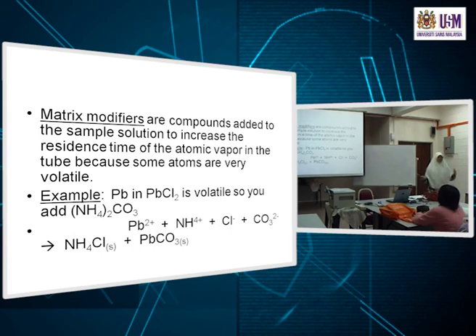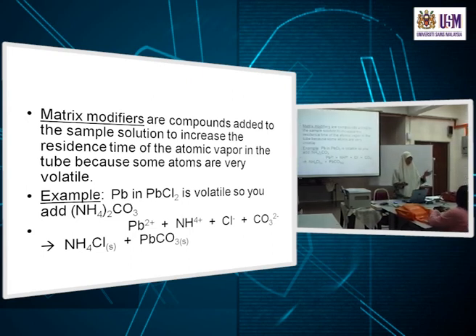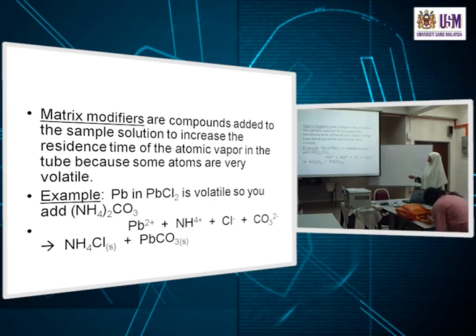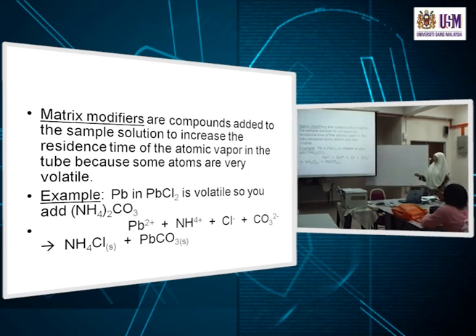There are several others, so it depends on which element, what matrix modifier would be necessary. Remember, you would not only add it to your sample, you may also add it to your standard solutions. And because you are adding some external reagent to your sample, you must make sure, of course, that the matrix modifiers that you use do not contain your analyte, that they are fairly high purity, so that you're not adding some metal which you are interested in to your sample and your standards.